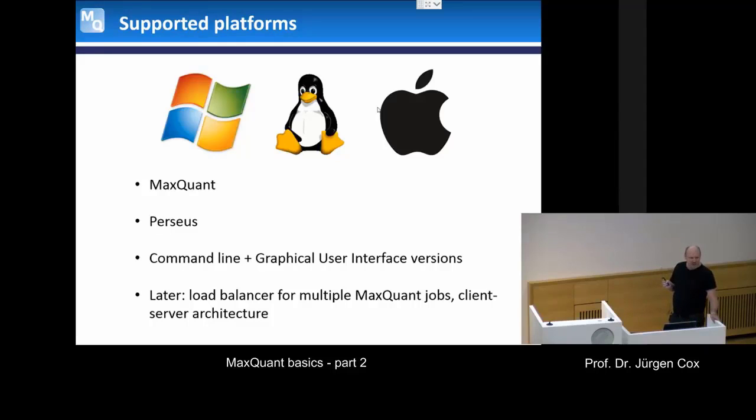But this is probably not such a big limitation, because people who wanted to go to the Linux platform probably wanted to use this from the command line anyway, either starting it from the shell immediately or from another script or something like this, right? So it's probably what you need, this command line version. And so far, we didn't do too extensive tests because we only finished it last week. But the data sets that I ran went through perfectly well.